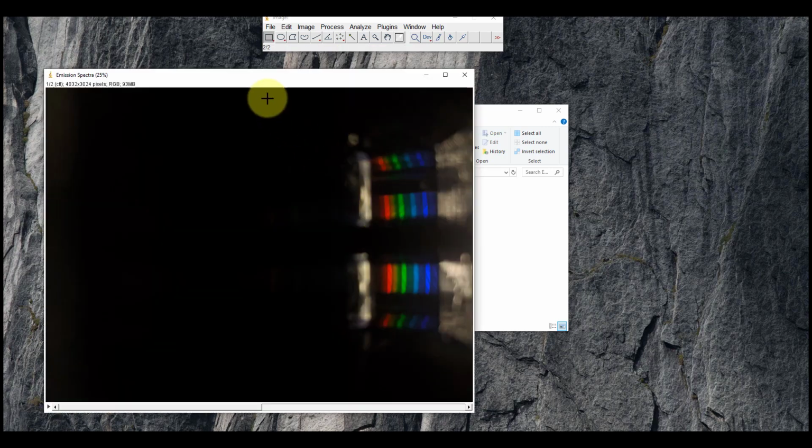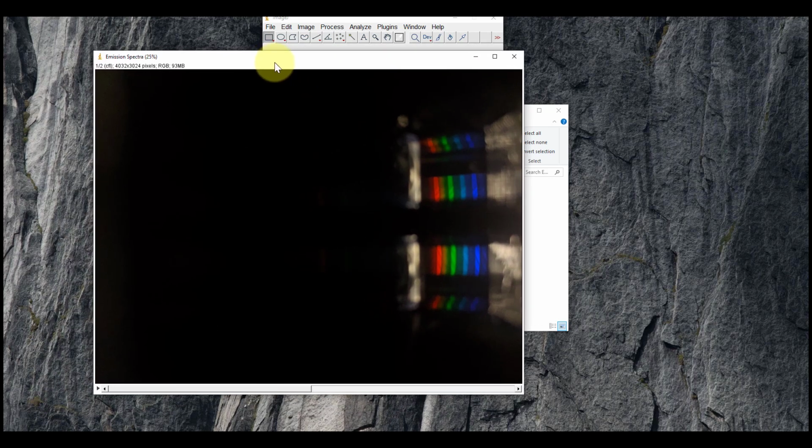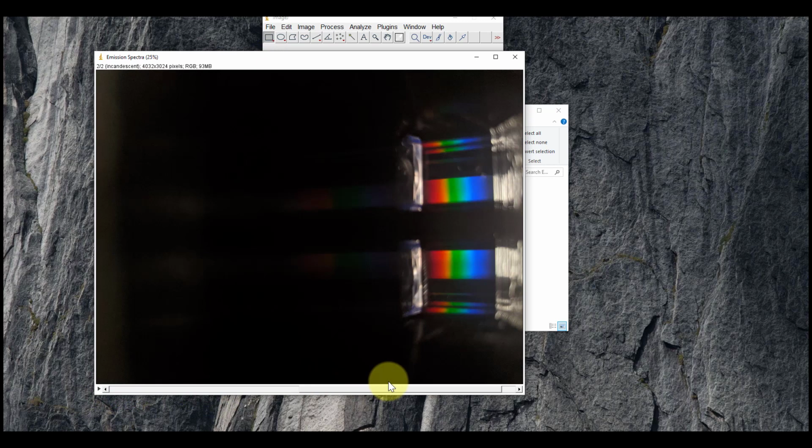And what you'll see is it loaded this image. But then now down at the bottom I have this slider, and the slider, if I drag it over, will drag it to my next image. So these are both of my images that I have loaded from the camera.